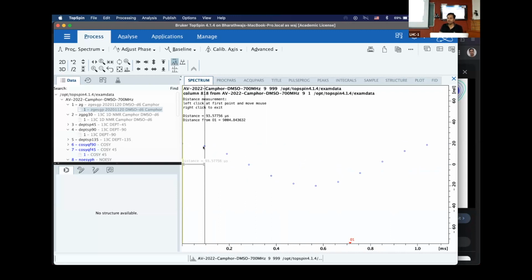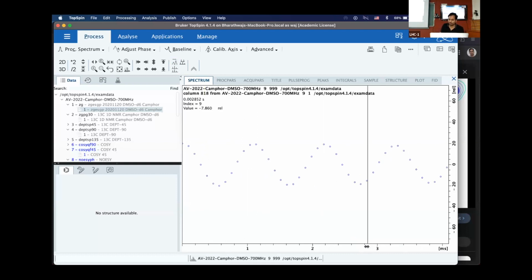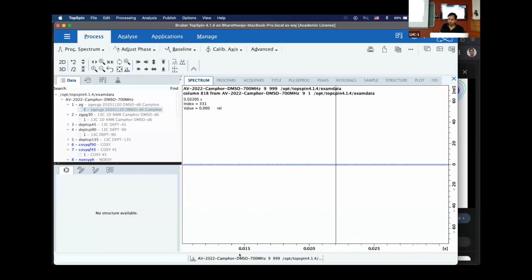I mean, you just calculated it, 93.66 or whatever, 94.66 or whatever, right? The next point will also be carefully measured at the exact same interval. I'm not measuring it precisely, but if you sit and measure it, the timing will be perfectly matched. So what you have done, first point you acquired 0 dt1. Next point you did 1 dt1. Next point you did 2 dt1, and so on and so forth to collect a total number of 128 points.